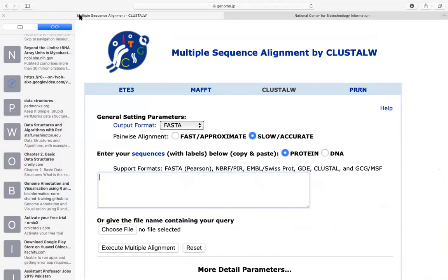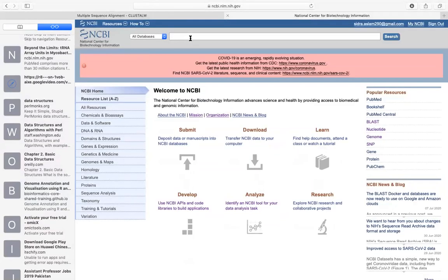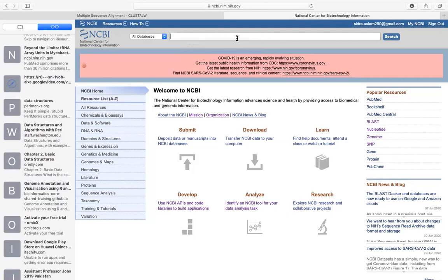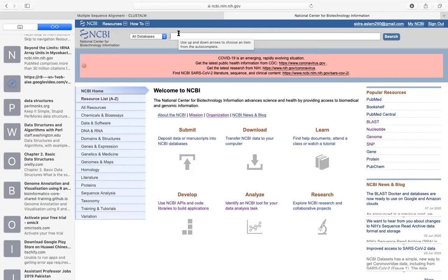One method I told you in class is to list the species you are interested in, and then retrieve them. There is a specific name — EMBL, EBI, DDBJ — these are the databases. You need to recall that. Here, we need to take a protein sequence because we want to align proteins.